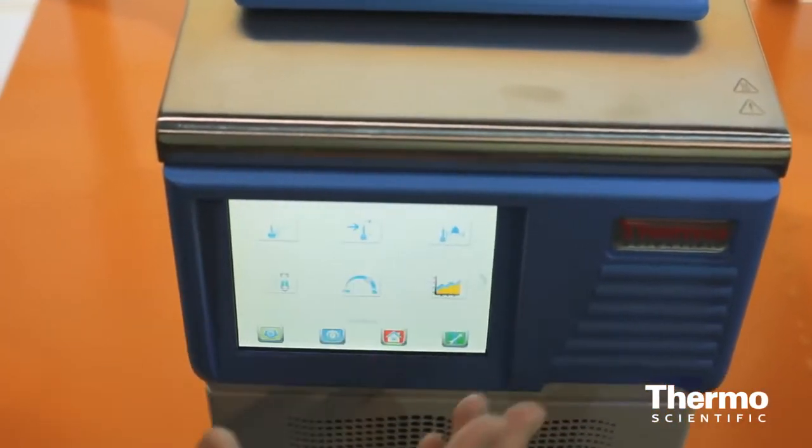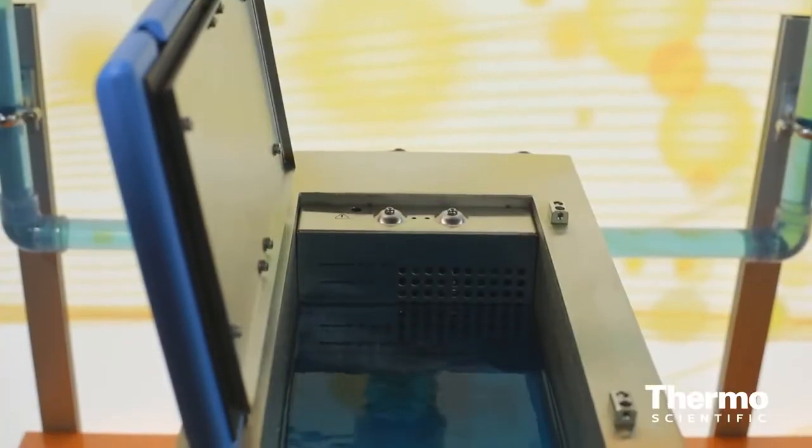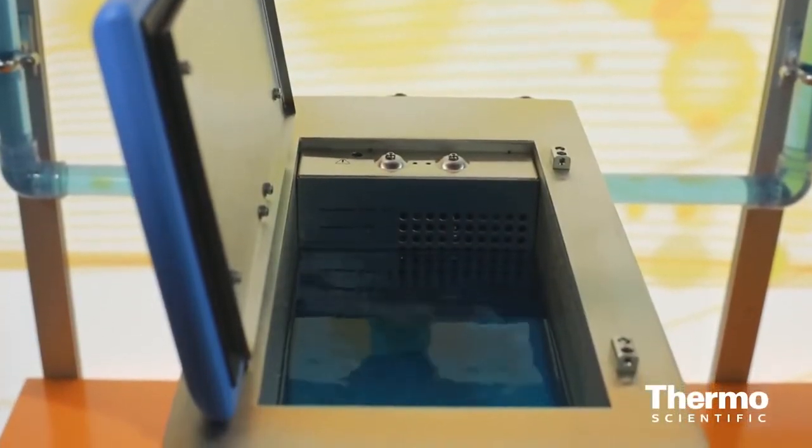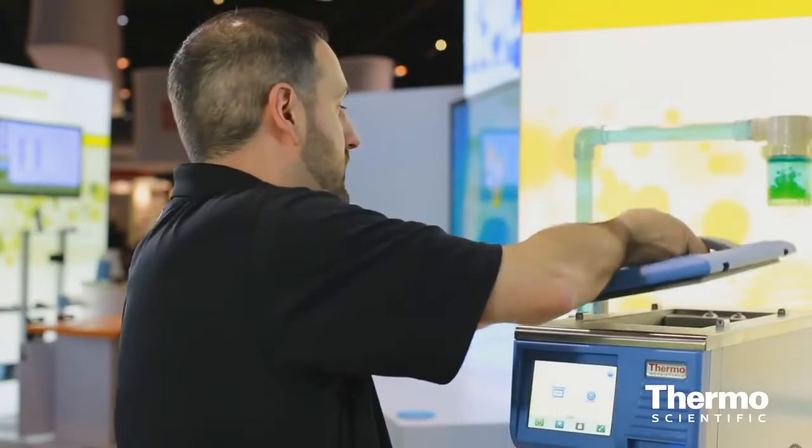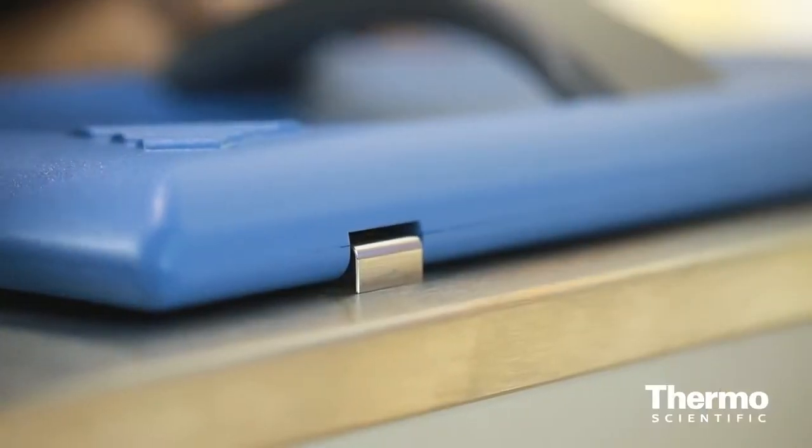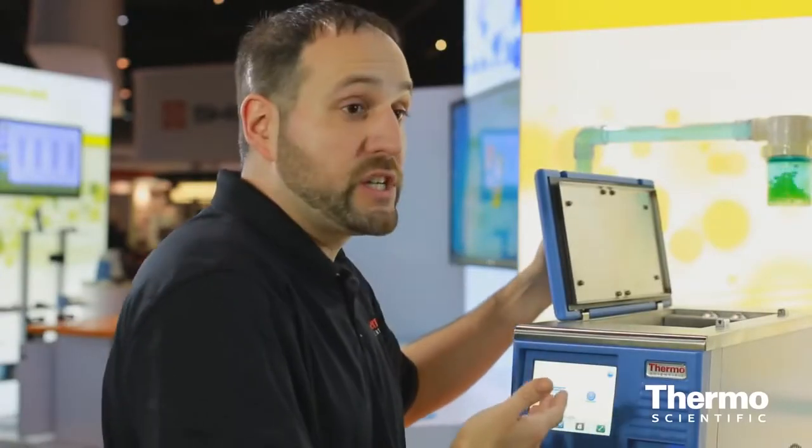You can maximize your sample size. You can maximize your capability. With the VersaLid, it's hinged. Any condensate would run back into the bath. And we've also made it for right-handed or left-handed operation.